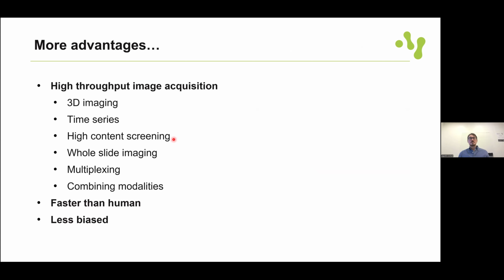And the advantage of bioimage analysis is that even if the data sets increase in size, at some point we will have to do it automatically, because on one hand, these analyses are faster than humans, but they're also less biased than humans.